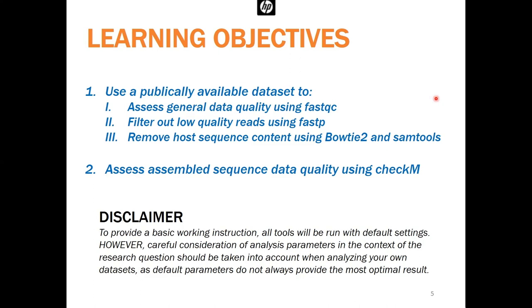SAMtools, Grace had gone over that tool in her previous workshop using long read data. Now we're going to be using short read data using the same tool. So a little bit of familiarity there. And then next, we're going to assess assembled sequence data using one of my favorite tools, CheckM.